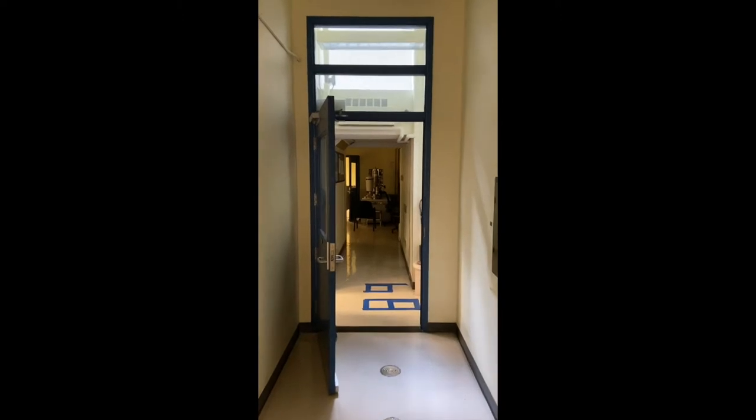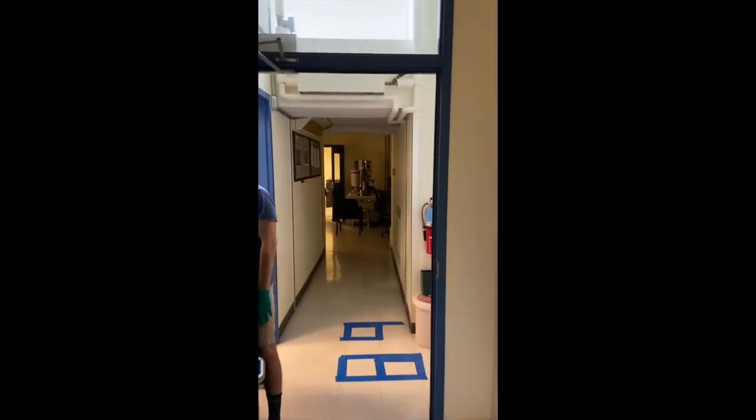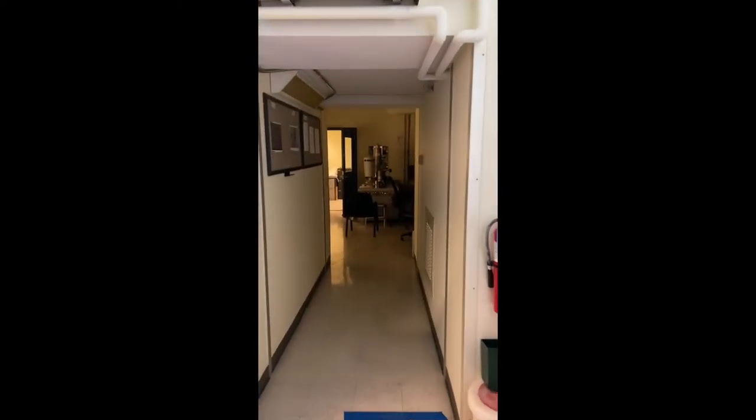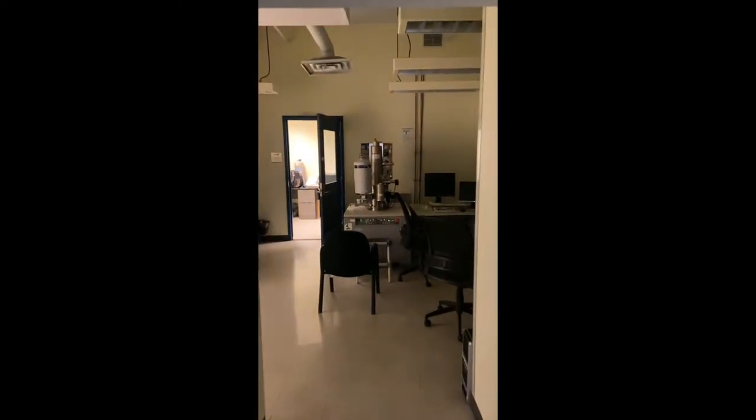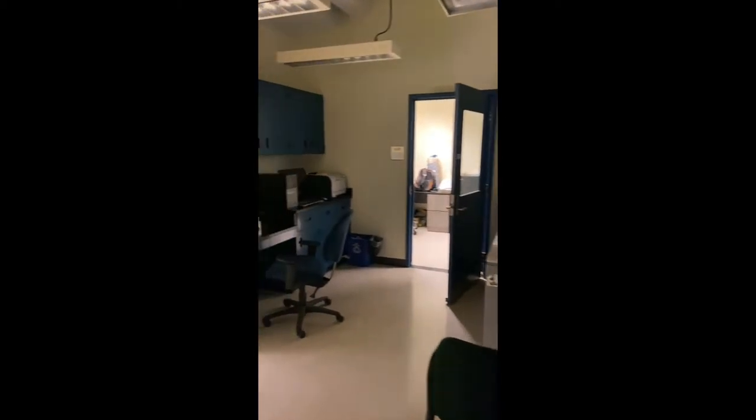The electron microscopy facility in Lashmiller is located in the basement. If you head down the elevators and exit to your left, it is in a wooden hallway about halfway down the main hallway. It's known as the Center for Nanostructure Imaging, or CNI, and inside are several different electron microscopes.